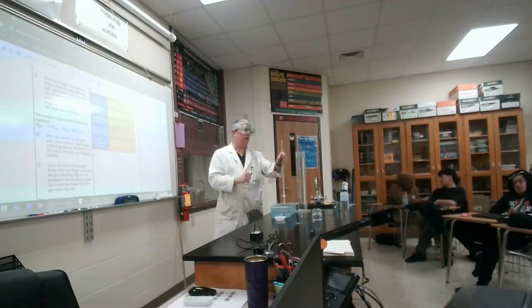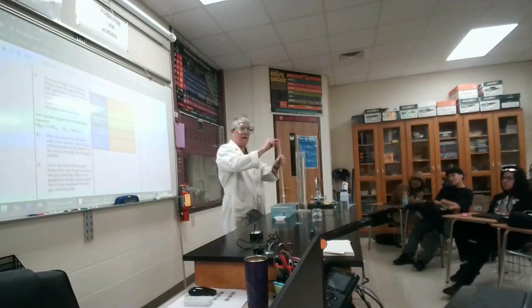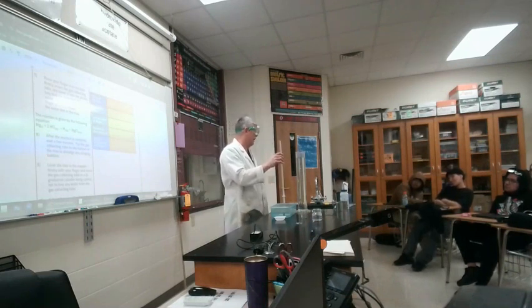Now we see a lot of bubbling going on, ladies and gentlemen. Now that reaction is really taking off. At the top here, I'm starting to see the gas being collected. It's starting to make its way to the top. The water level is going down and down. We are actually collecting that gas.